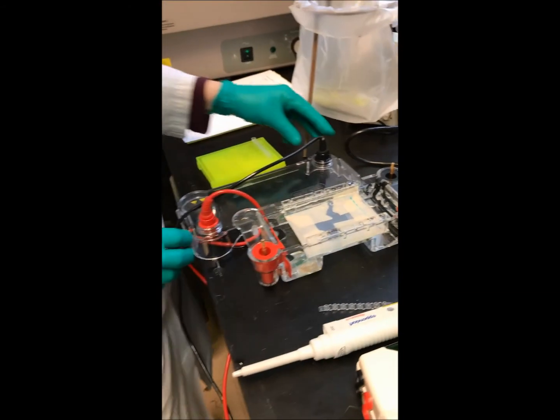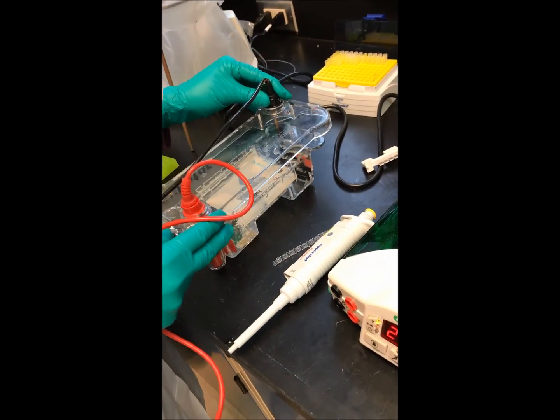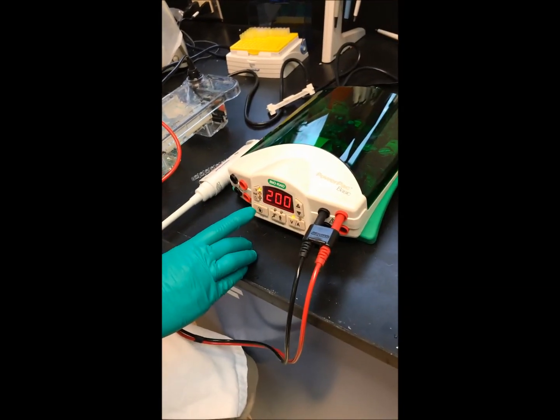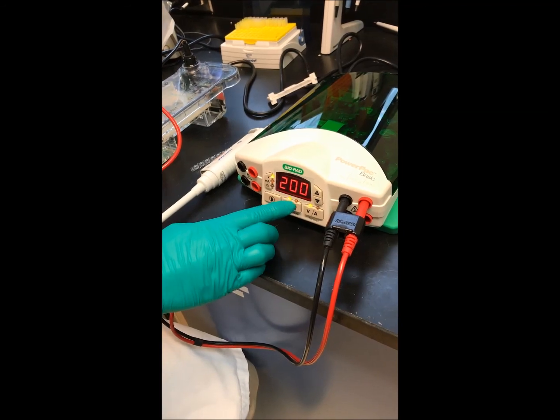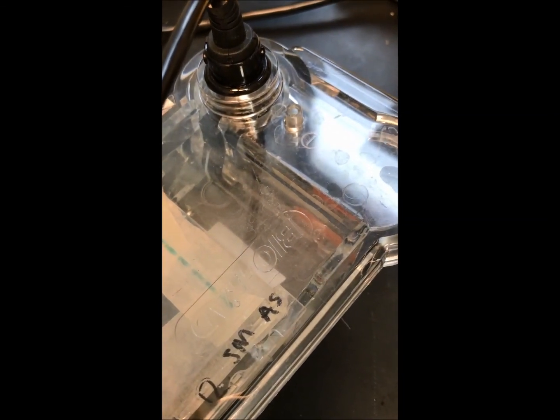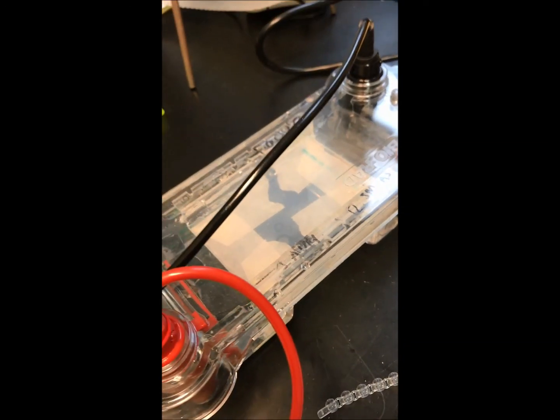Now I'm ready to run, to pass the current, to do electrophoresis. I'm going to close the lid of the chamber, and the setting is 200 volts for an hour, and all I need to do is press run, and it's running. Okay. So we know that the current is going because we have these bubbles that form at the electrodes, at the poles of the chamber. It's going to slowly migrate into the gel and separate according to size.